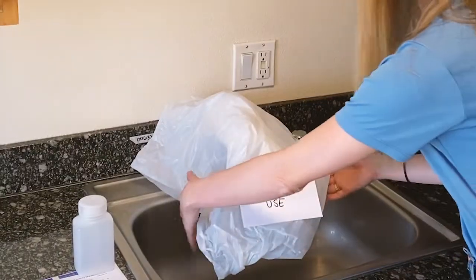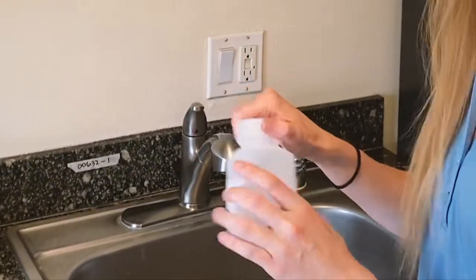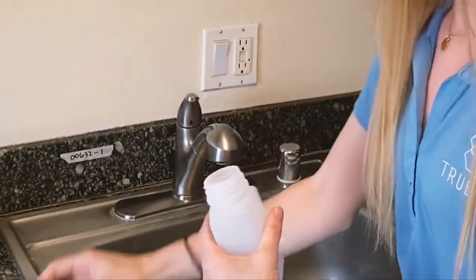Next, remove the sign and plastic bag from the outlet you're going to sample. Open the labeled sample bottle with clean hands. Make sure not to touch the inside of the bottle or lid.